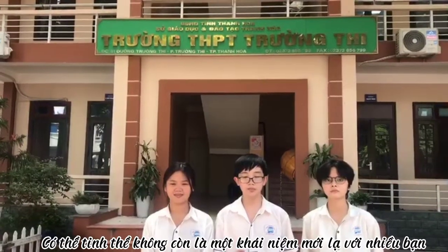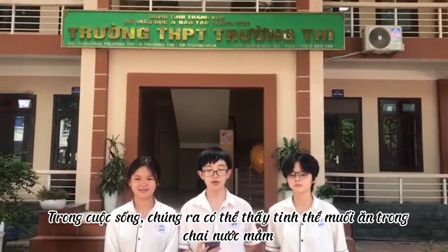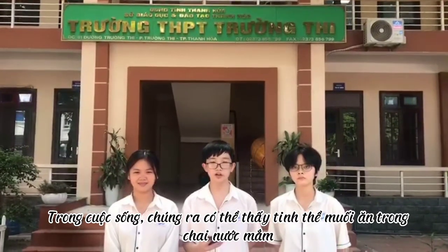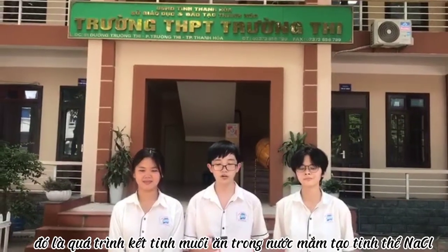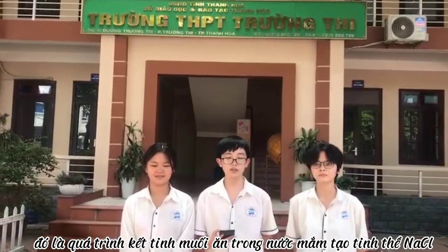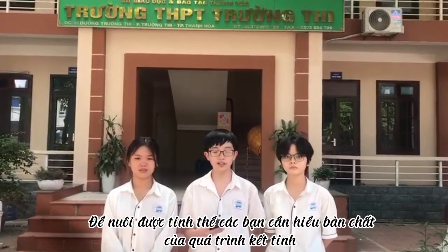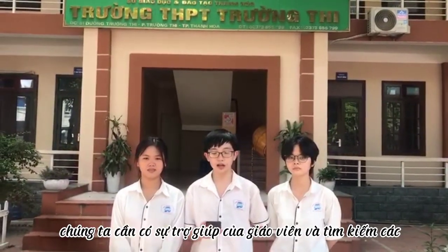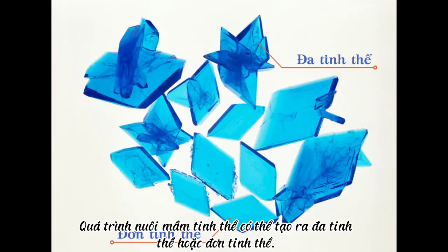Many of you may be familiar with the concept of crystal in life. We can see crystal of table salt in fish sauce. It is due to the crystallization of sodium chloride crystal. To grow crystal, you must first understand the nature of crystallization, which requires the assistance of a teacher as well as the use of books and the internet to gather information. The crystal culture process can produce polycrystalline or single crystal.